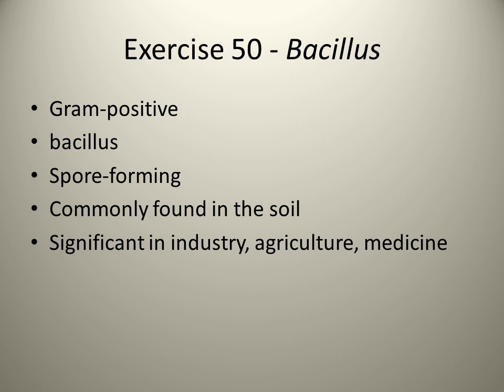industry, agriculture, and medicine. In this lab, you would take a soil sample, and one aspect is to mix the soil with water and heat that up. Because they are spore forming, what you're trying to do is kill all the vegetative cells that are there, and then just have those spores remaining.